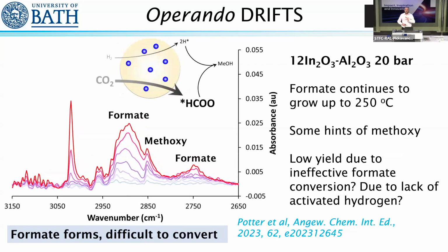We then looked at the indium on its own, and we saw the reverse trend. We saw the formate happily growing and growing and growing, and it just kept growing. So this again tells us that here, indium, fantastic at activating the CO2, however, very slow at activating the hydrogen.